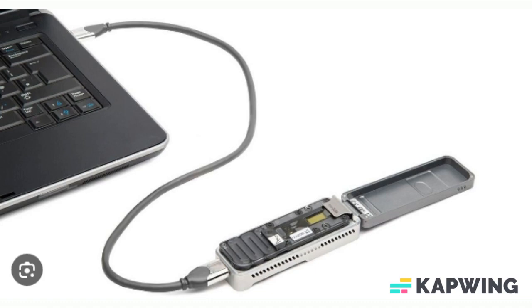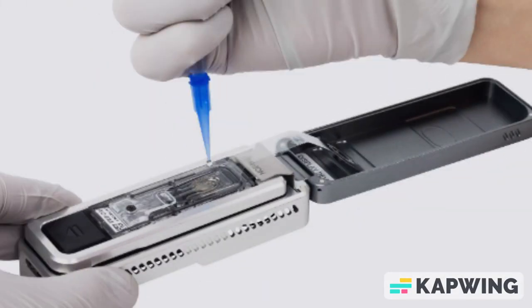It's a mobile single-molecule nanopore sequencer that measures 4 inches in length and is connected by a USB 3.0 port to a laptop computer. This device has been released for testing by a community of users as part of the MinION Access Program, MAP, to examine the performance of the MinION sequencer.